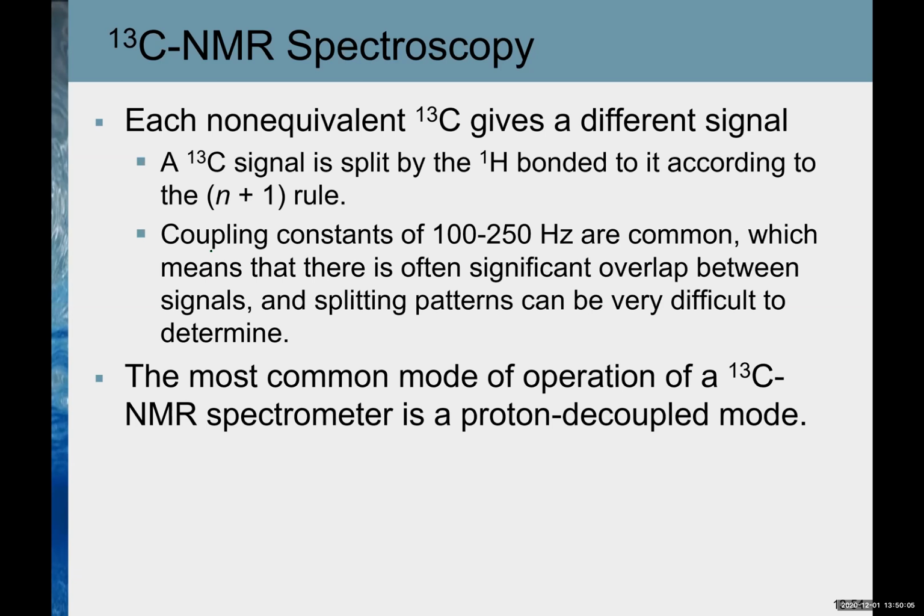By combining all that, you can figure out most of the structure. NMR alone cannot provide enough information to calculate the exact structural formula, but it gives quite a bit.